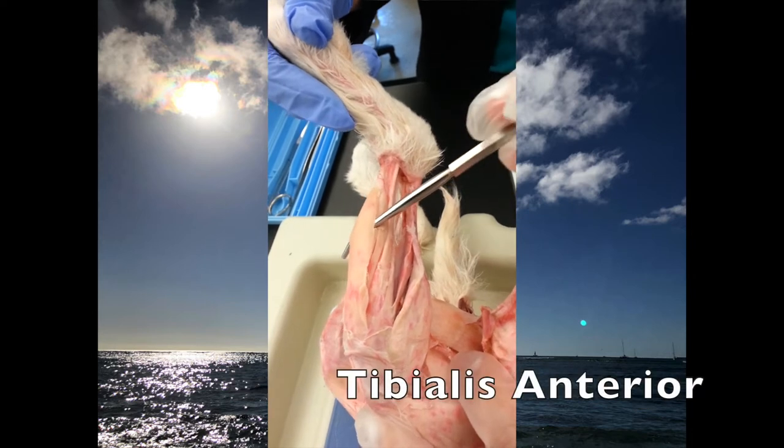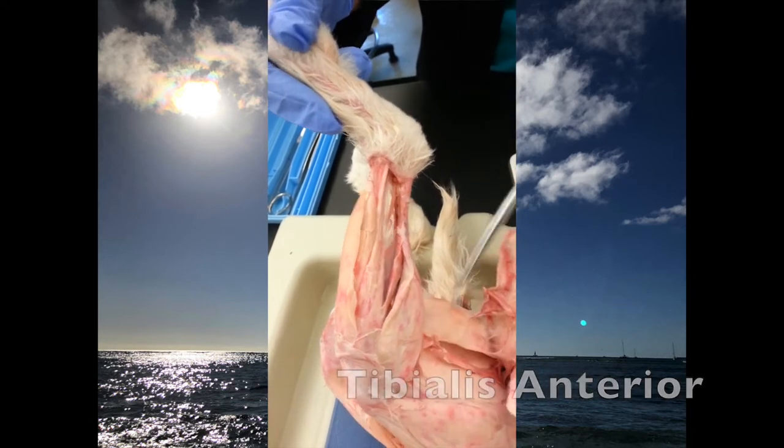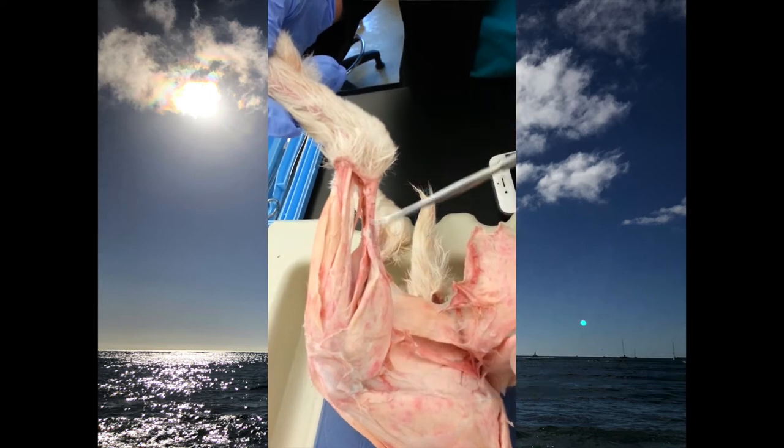And then the tibialis anterior, the sciatic nerve, and the popliteus.